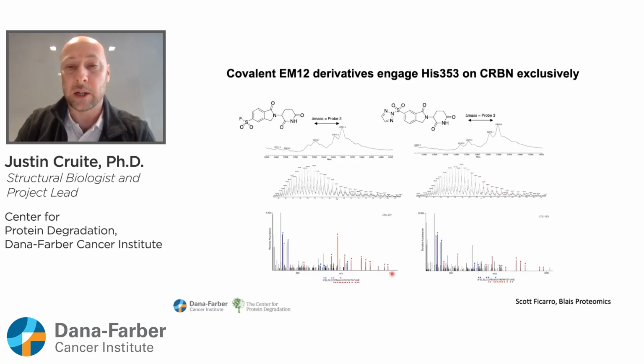They also digested the protein and then did peptide mapping to identify the labeling site and confirm that we are specifically covalently labeling histidine 353 in cereblon.